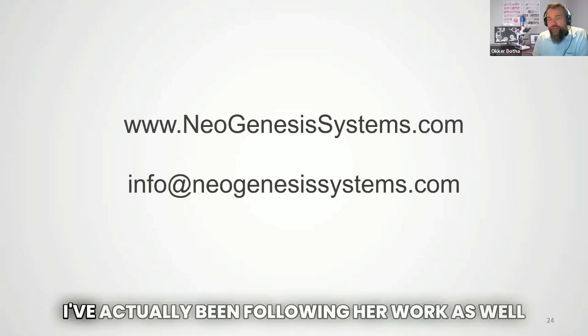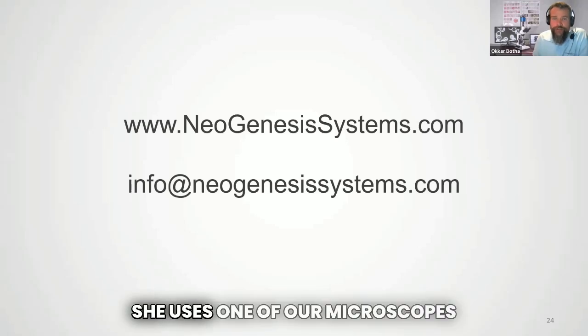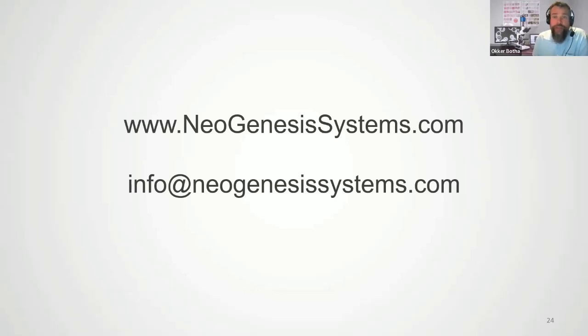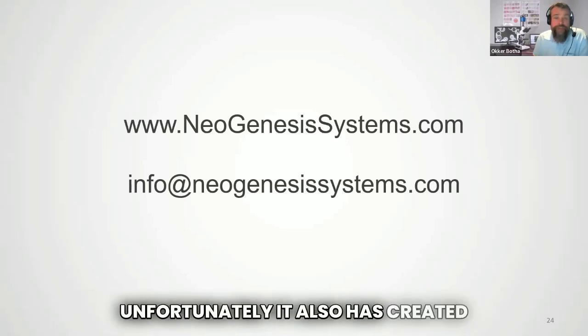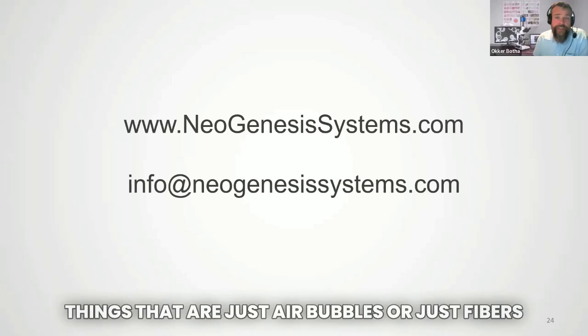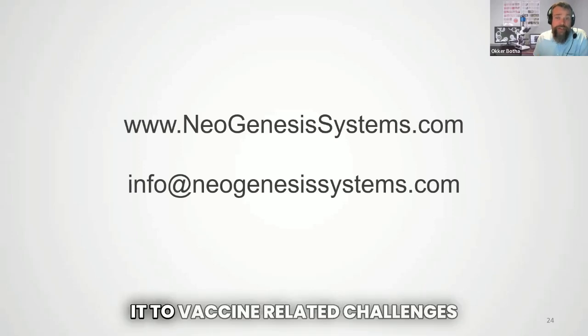Yes, I have. I've been following her work as well. She's one of our past attendees, and she uses one of our microscopes, so she was able to see these things. She has a large following, and lots of people read her content. Unfortunately, it has also created a lot of confusion. A lot of people are looking at artifacts, things that are just air bubbles or fibers that made their way into the sample, and relating it to vaccine related challenges.